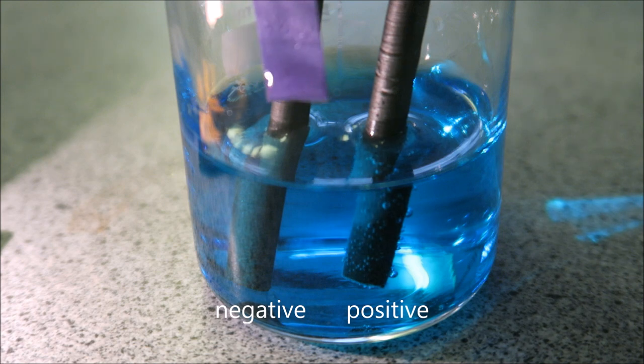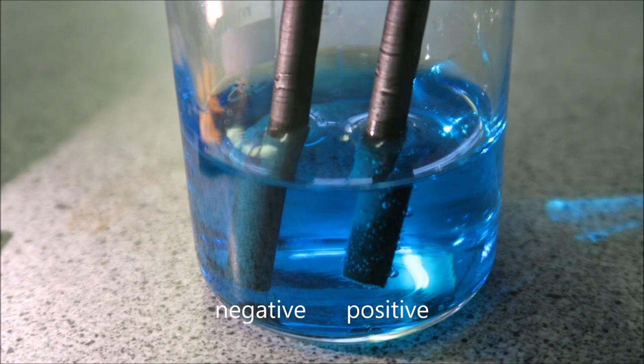So we can see that the litmus paper is still blue, indicating that no chlorine has been produced.